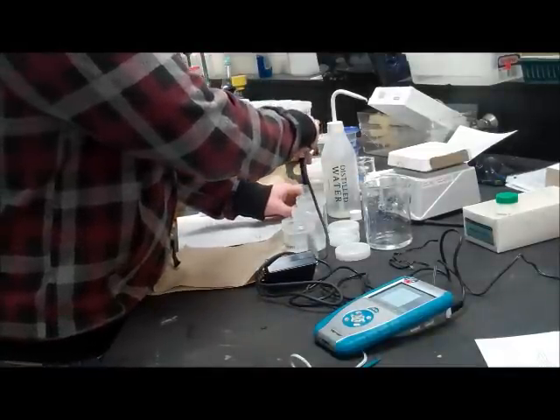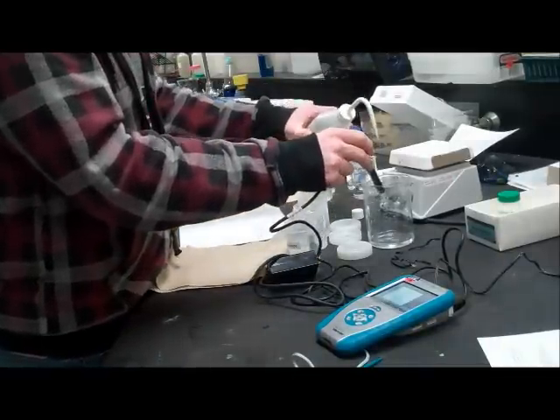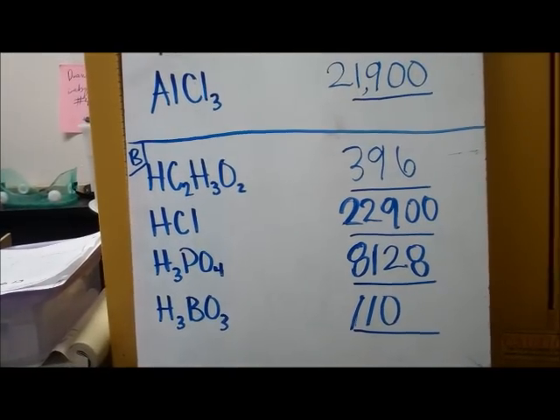The reading is 110. So that is it for group B.